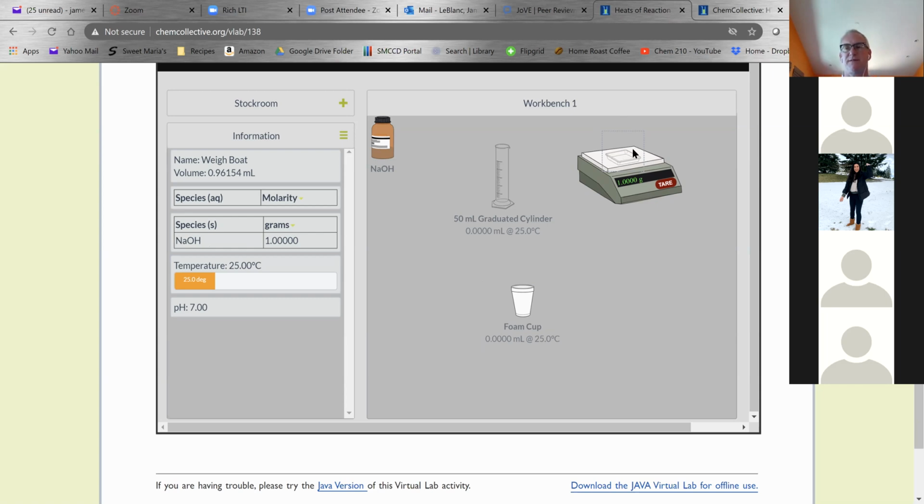Yeah, just take it off the desktop and then just put a new balance on. Yeah, I basically recycled the weigh boat. And I put 1 gram in it. So I got my 1 gram of NaOH.